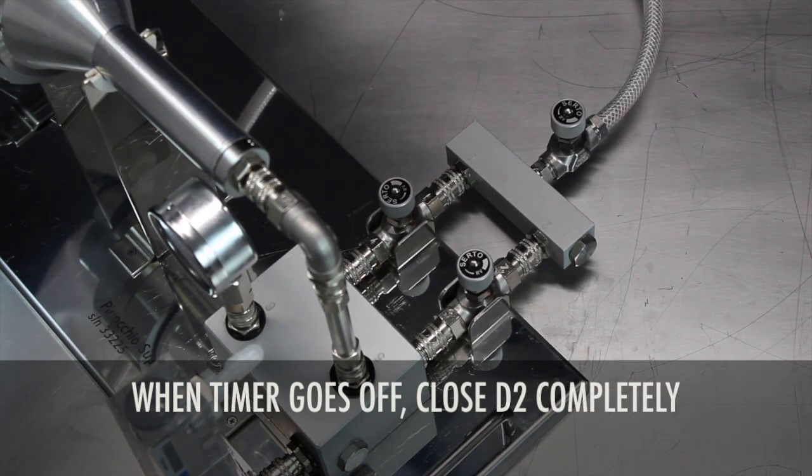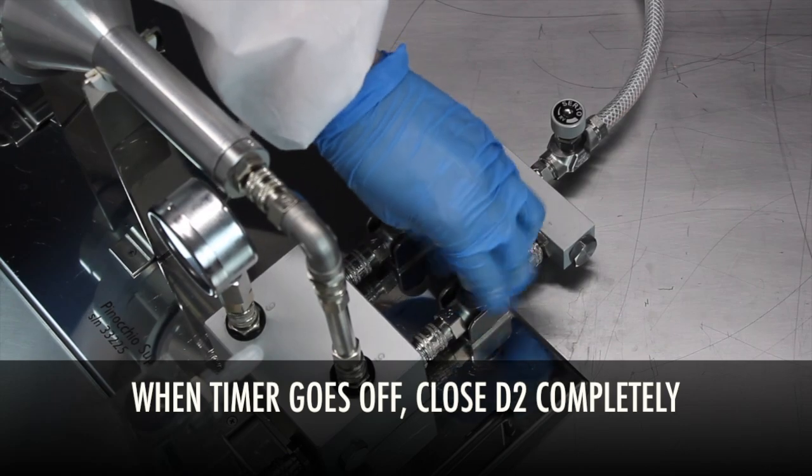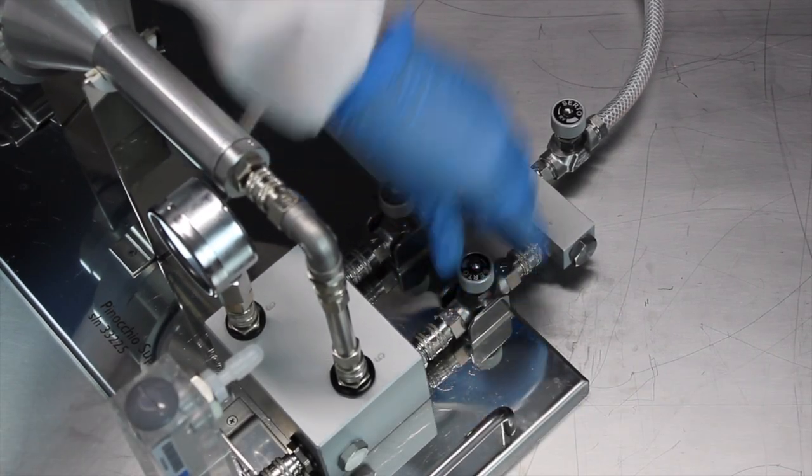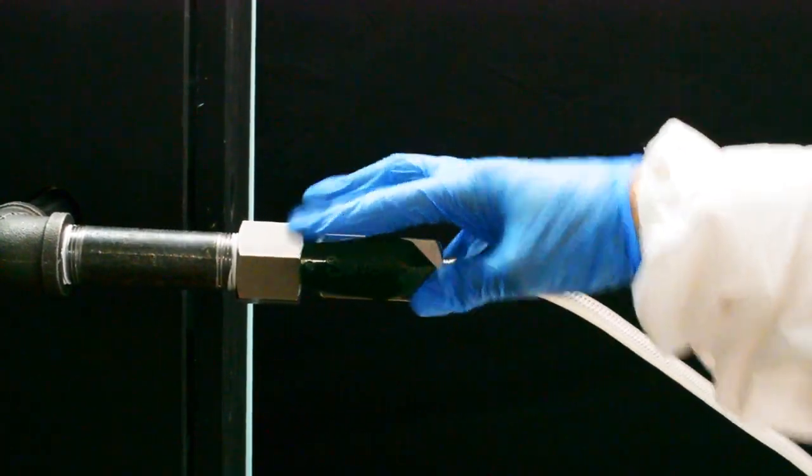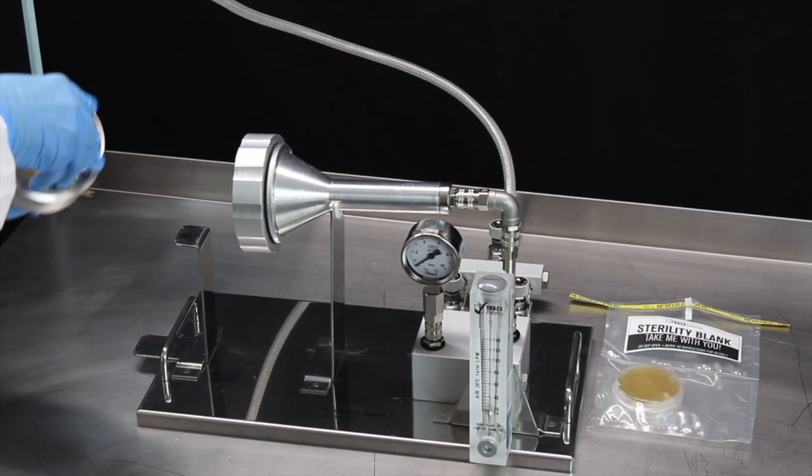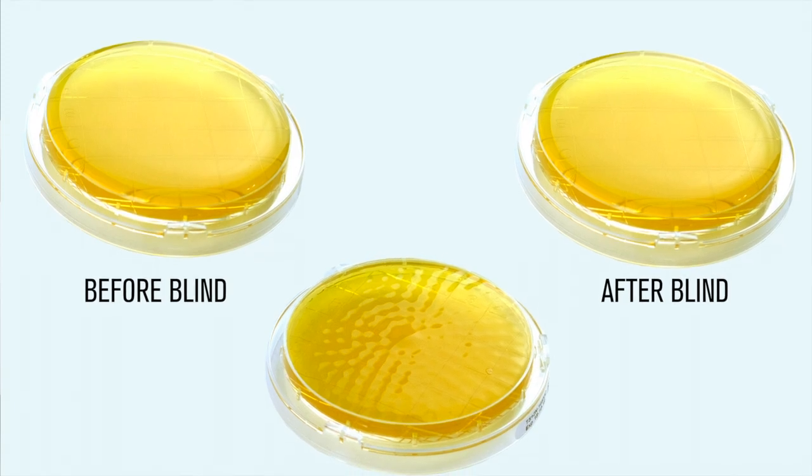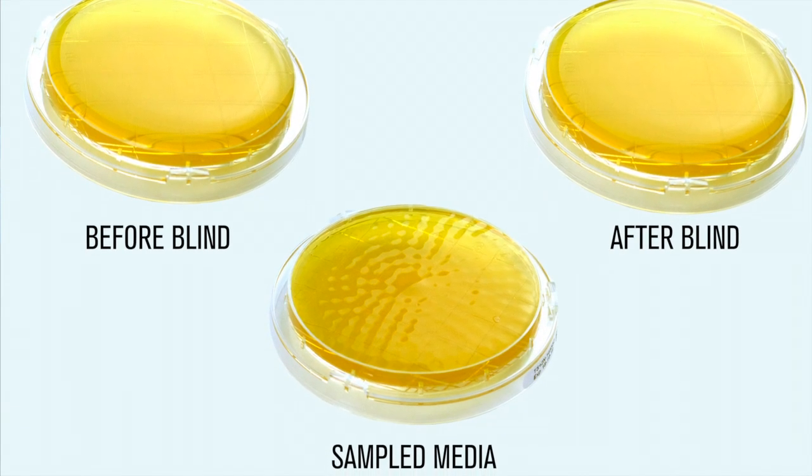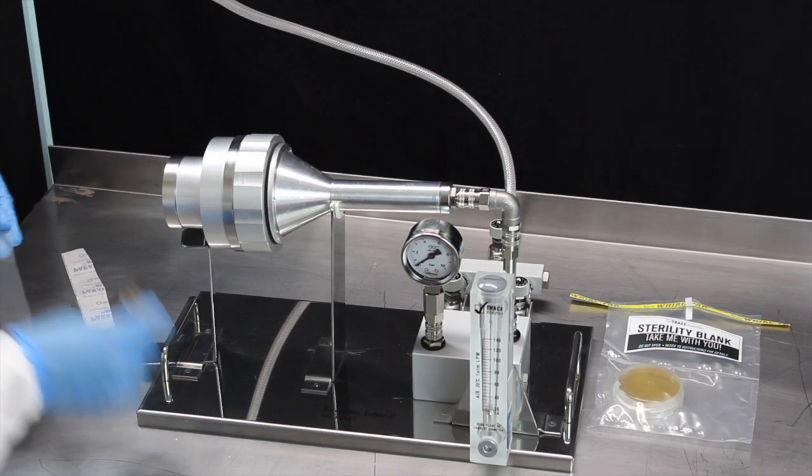When the timer goes off, completely close D2 and close the control valve at the sampling port. Remove the plate from the contact plate housing and immediately lock the lid in place. Agar should be dimpled at the end of the test, showing successful impaction of the compressed air onto the contact plate.